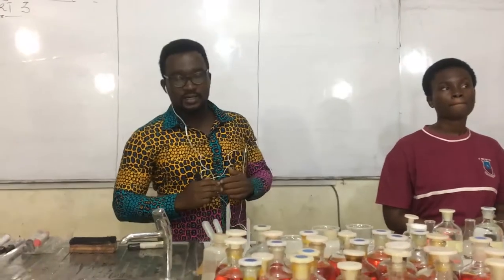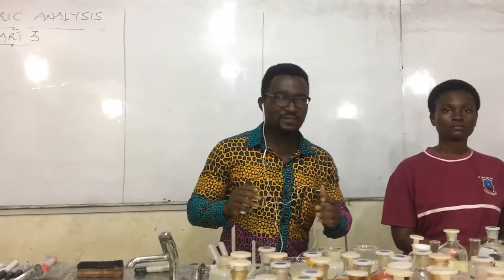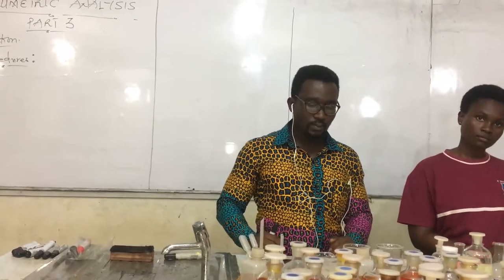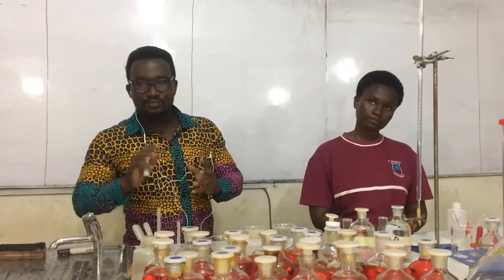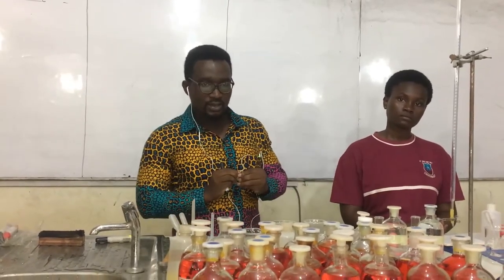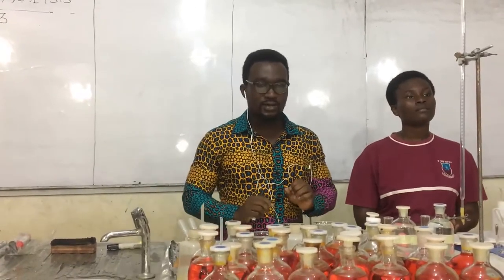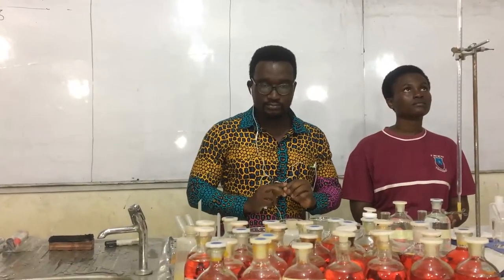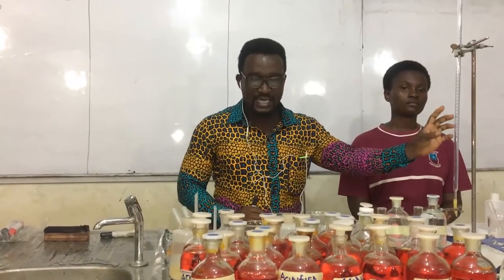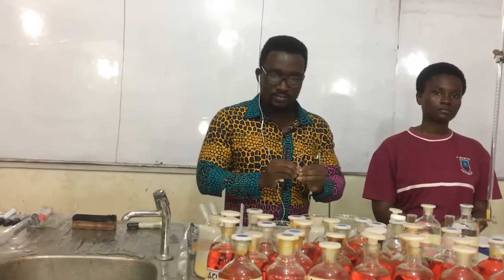Now, we are going to begin with the act. But before we begin, I want to ask a very simple question, which is supposed to be answered by you. When I was describing the procedure, I said specifically we have rinsed the burette 3 times with tap water, 3 times with deionized water, and then we have also rinsed the same burette with a few cubic centimeters of solution A.